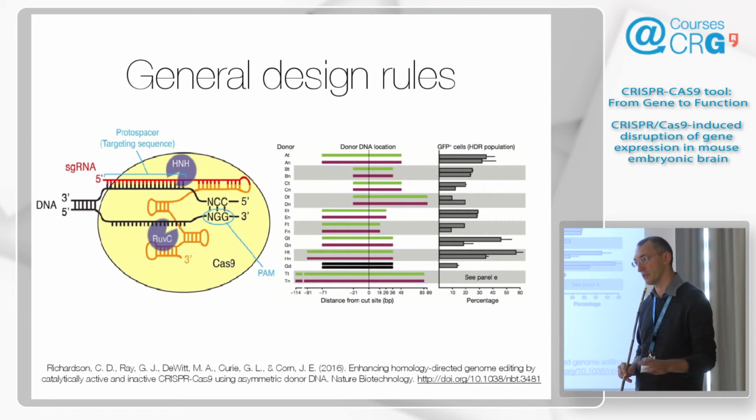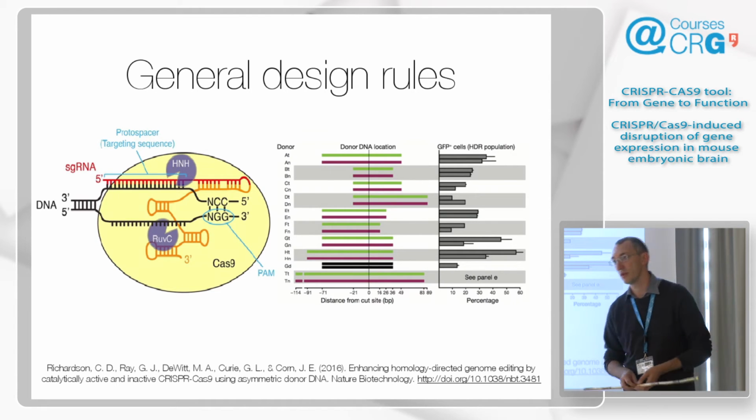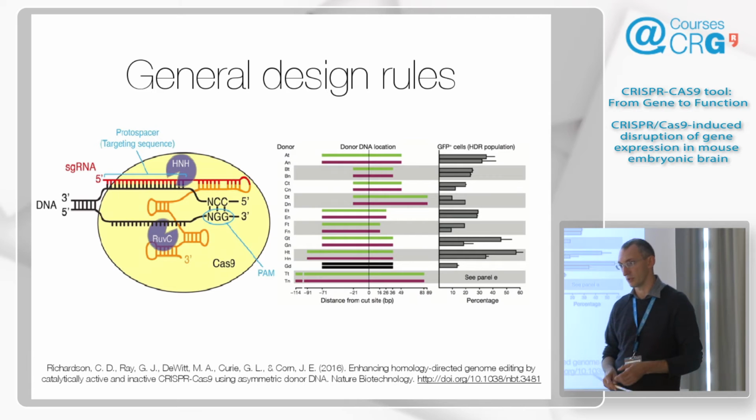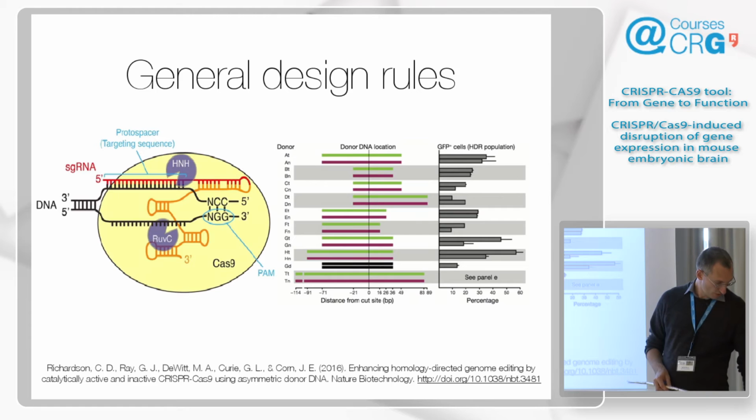This was way less efficient compared to nuclease. So I would only use it when it is absolutely necessary. Let's say for patients, for humans, one day when we get there. But for model organisms, you can rather get the higher efficiency and deal with the off-targets by the many other ways you can, and I'll come to that.